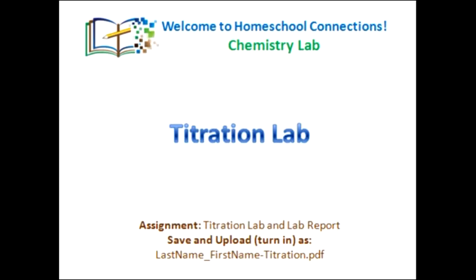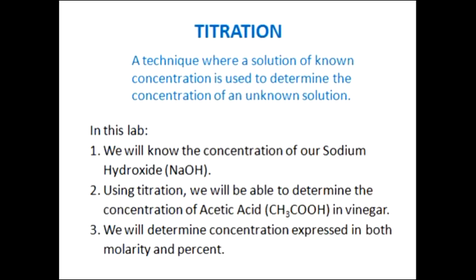Today we're going to be discussing your Titration Lab. A titration is a lab technique in which you use a solution with a known concentration to help you determine the concentration of another solution.